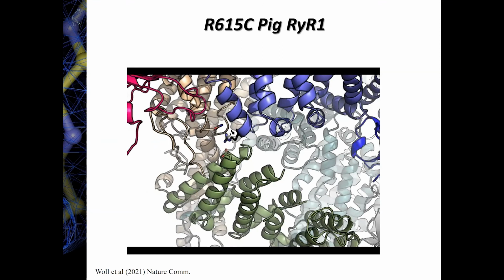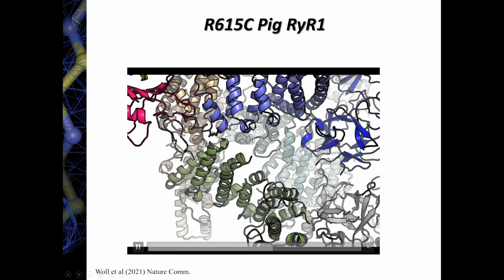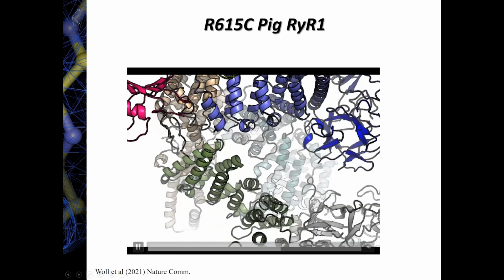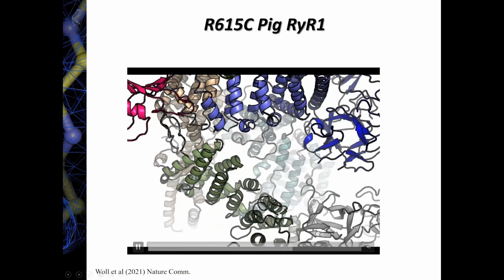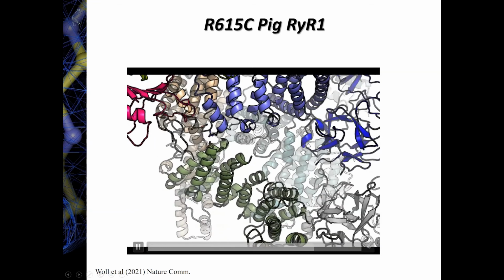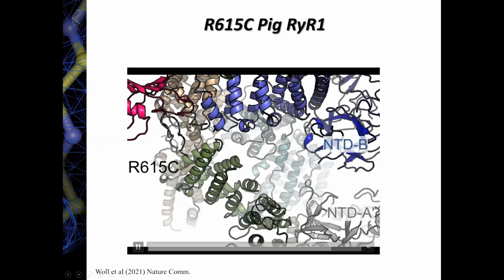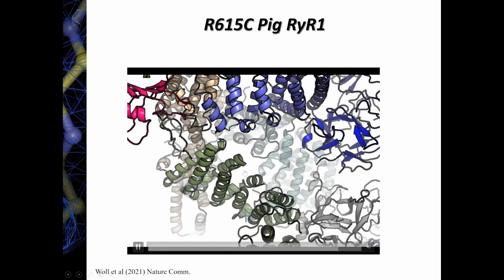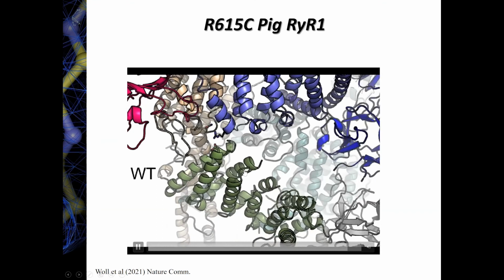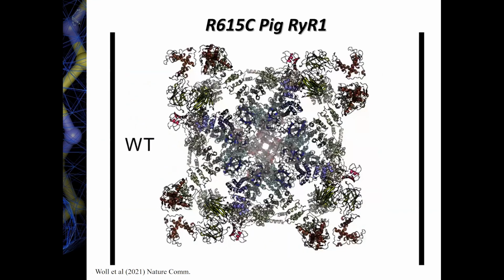And so the tilt is, of course, small, relatively close to the hinge point, but the further away you go from that hinge point, these movements are actually large and they're in the order of around 10 angstrom. Okay, so just interfering with this interaction between these domains here can cause a large tilting motion, a pretty large conformational change.